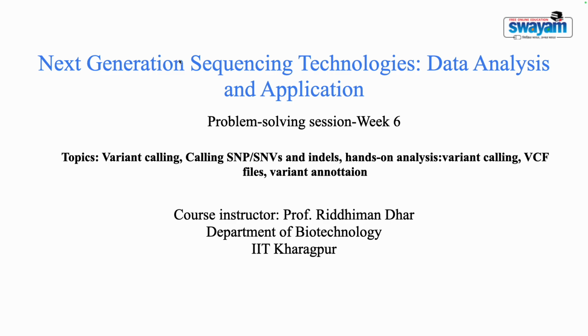Again, good evening all. So we will start with our problem solving session for week 6. The topics we will be covering today are variant calling, calling SNPs and SNVs and indels, hands-on analysis, variant calling, VCF files and variant annotation. This course is taken by Professor Riddhimandhar. He is a professor in IIT Kharagpur in the Department of Biotechnology.